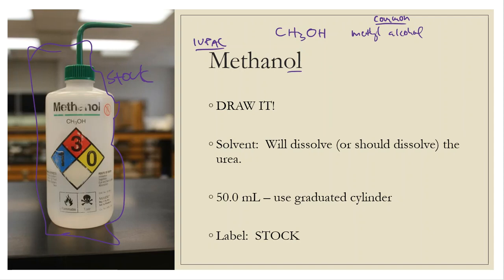Common name uses the full word alcohol, and IUPAC does not. It only uses the ending of OL. As far as the solvent goes, the question here says it will dissolve or should dissolve the urea. Not at room temperature, though, and not at cold temperature either. So methanol will dissolve the urea, but it's going to take a little bit of energy on your part in order to get this to dissolve, and that energy is going to come from a little bit of heat and a little bit of stirring.